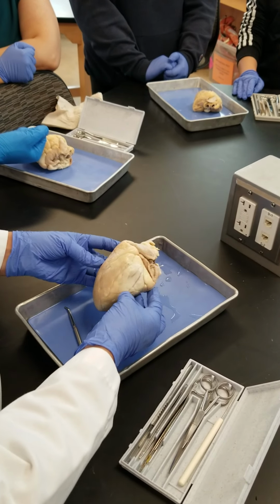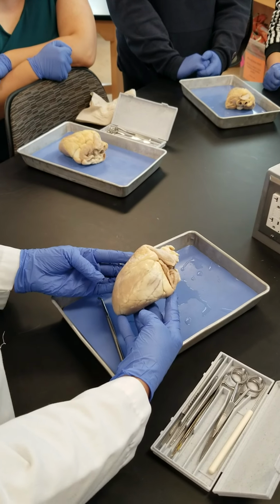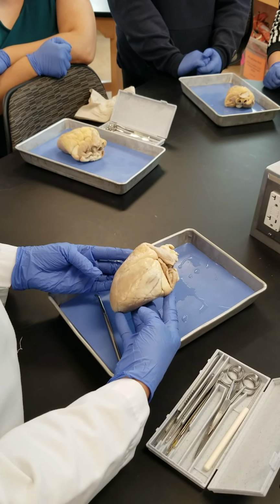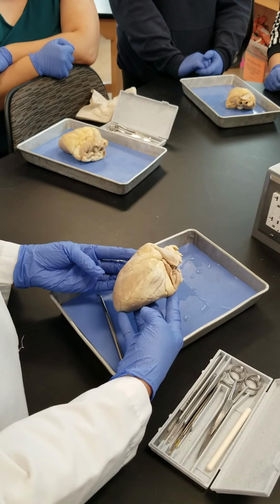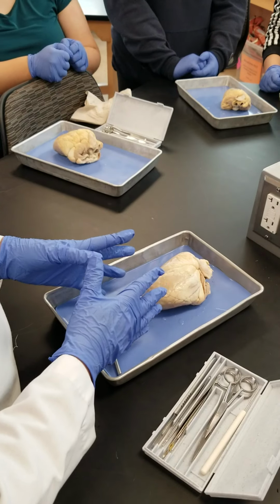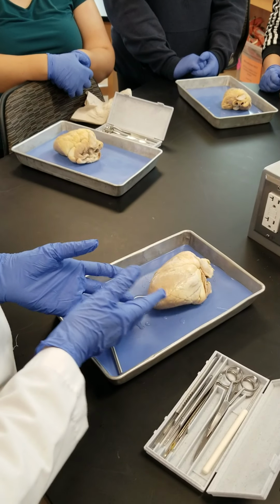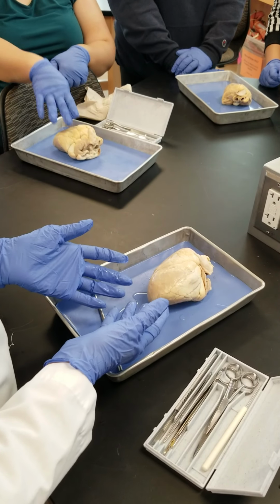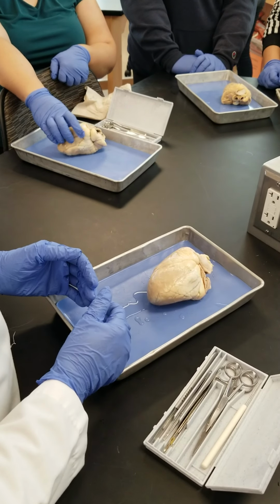So here, we have a sheep heart, and we want to dissect it, and later you will be asked about it in your practical exam, right? So we have to know everything about that. To review all the things that you have in the list, first we need to go from the outside of the heart and recognize the structures that we can see from the outside. Then we cut it, and then we go to see inside of the heart, right?